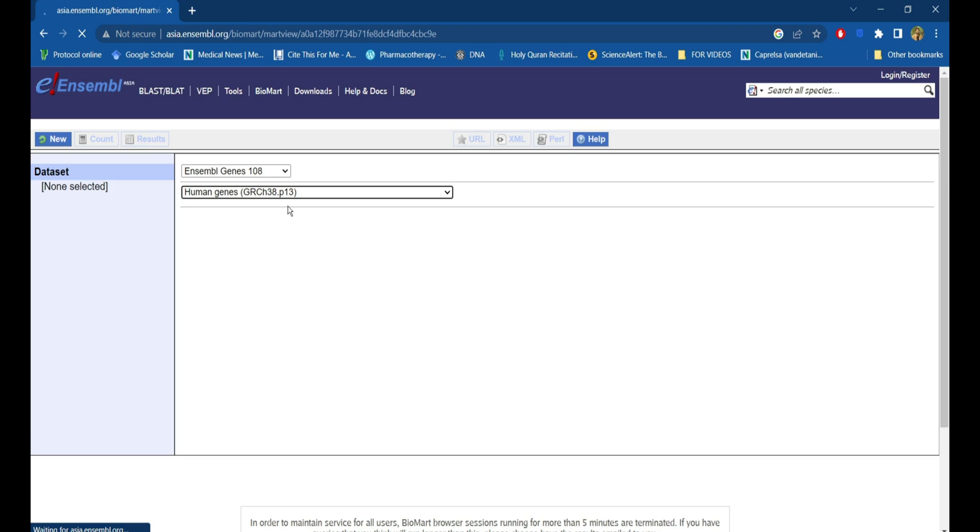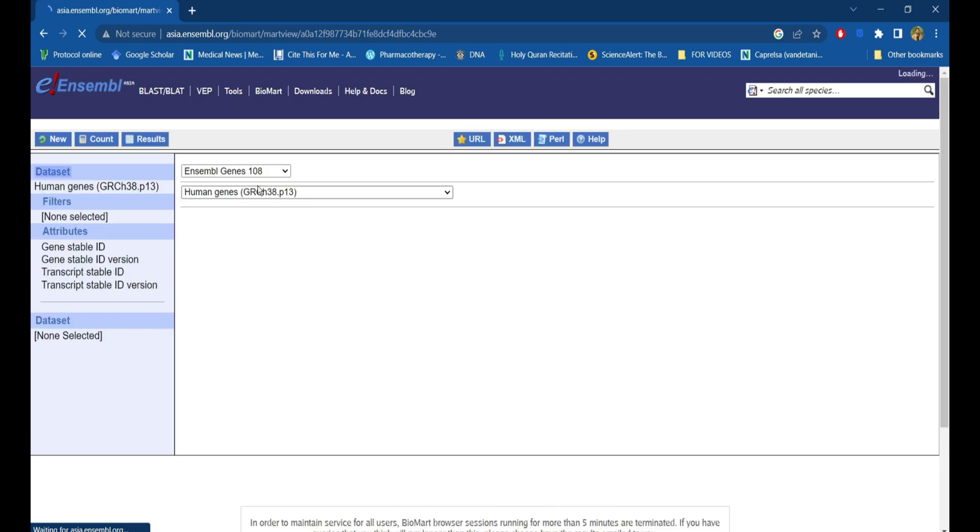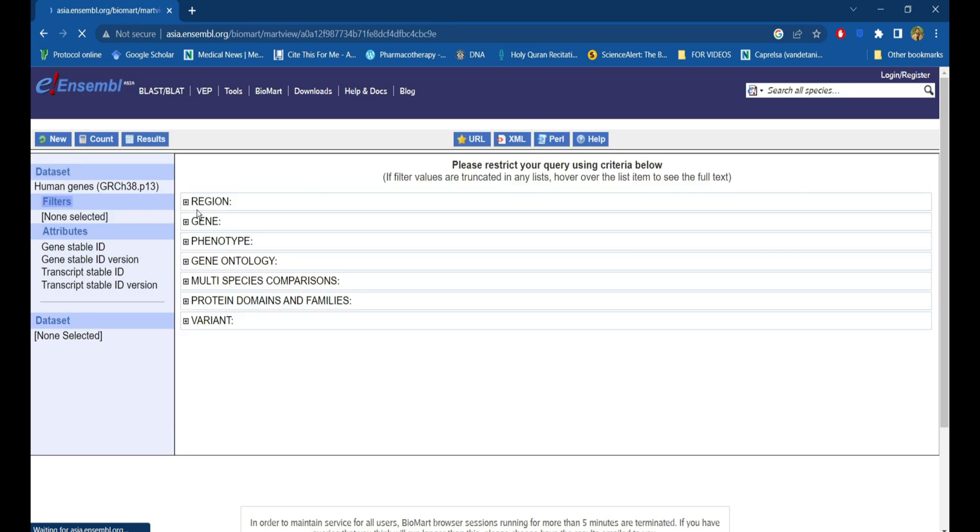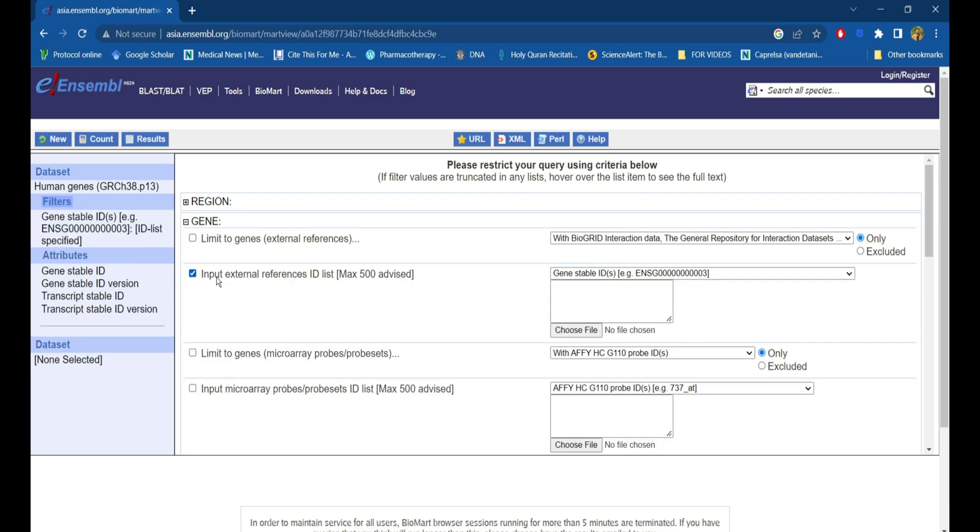Once these two parameters are set, it will open up the filters and attributes towards the left side. Select the filter and go to the gene section.